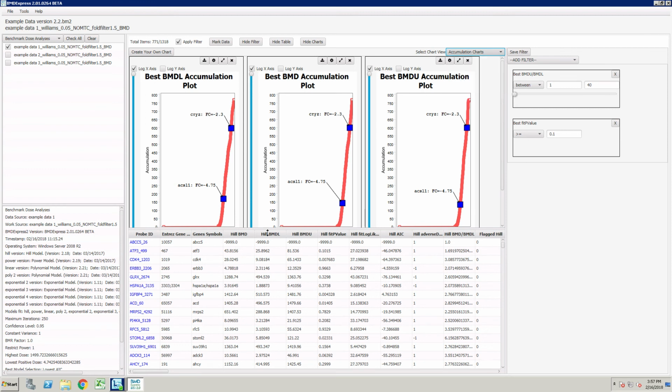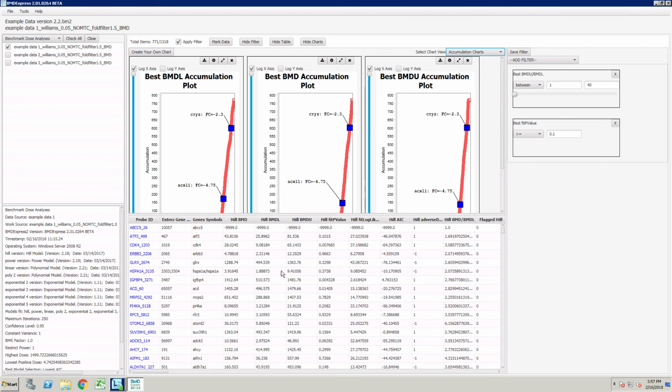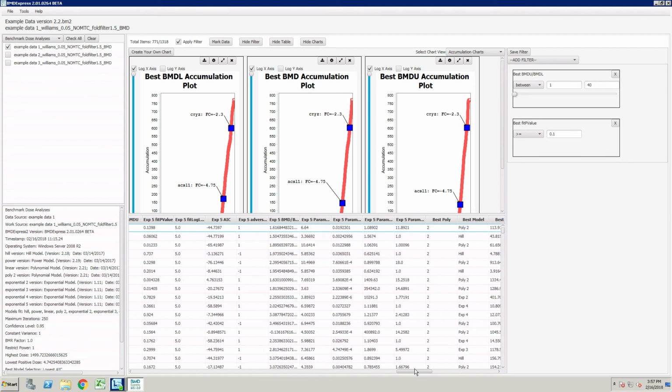But yes, you'll see more of this sort of stuff, these interactive plots, as you get down into the functional classifications, which is the next step. So what you've done here is you've identified BMD values. So this basically gives you the specifications of all the fits for each one of the probes. You can actually take the data here and completely recapitulate, if you have the model formula, the dose response curve, at least the model dose response curve.